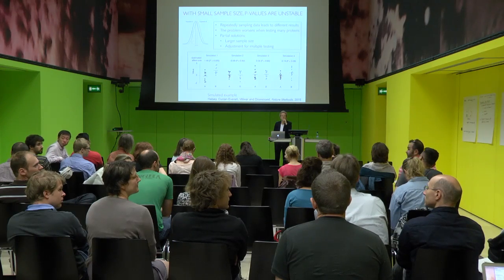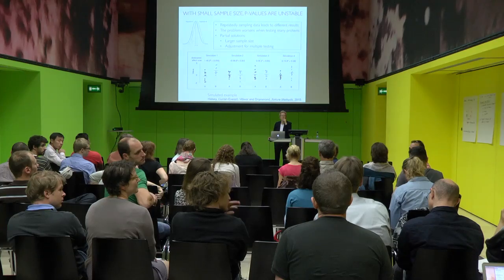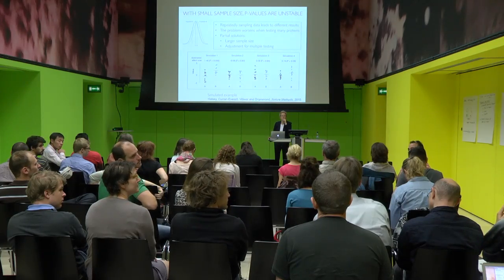Just a short question about normalization, because you briefly touched on normalization. So you said you always take assumptions if you normalize. So what would be your suggestion for normalizations? It's very specific to your experiment, right? And I will talk about this on Thursday, but maybe we can start. So usually you assume that something is not changing between runs, right? Because that you would want to normalize to, right?